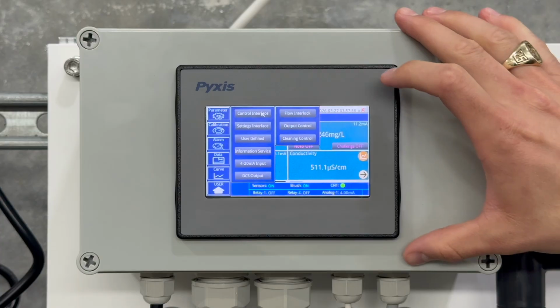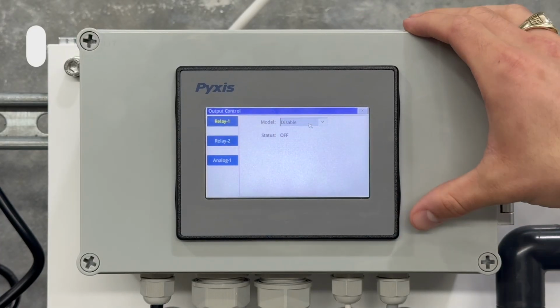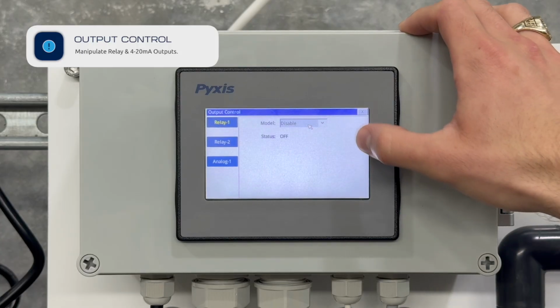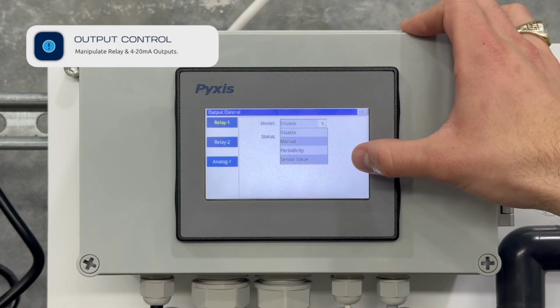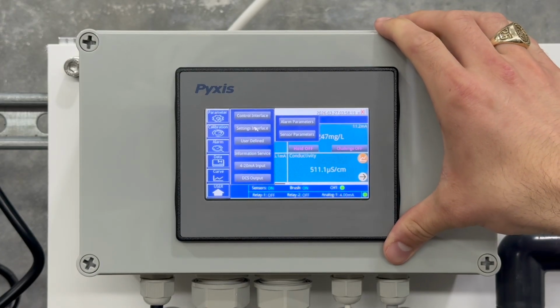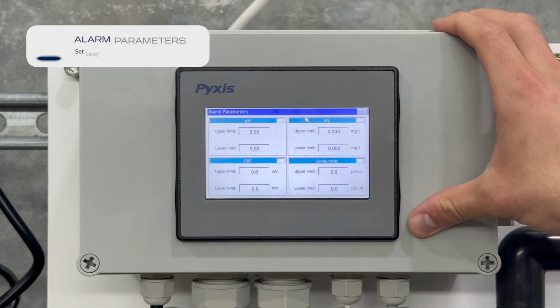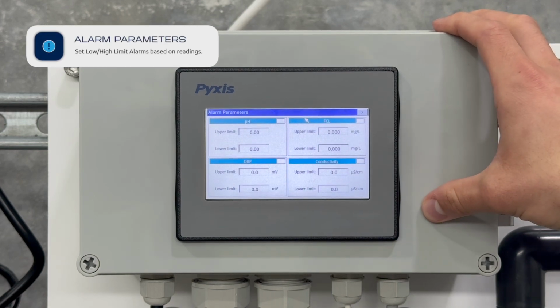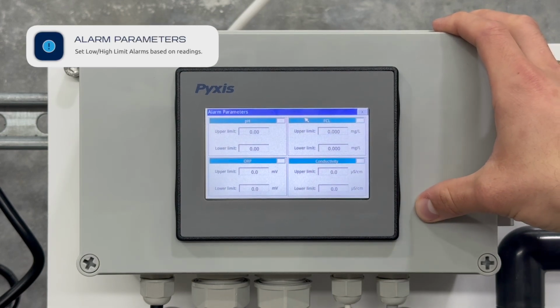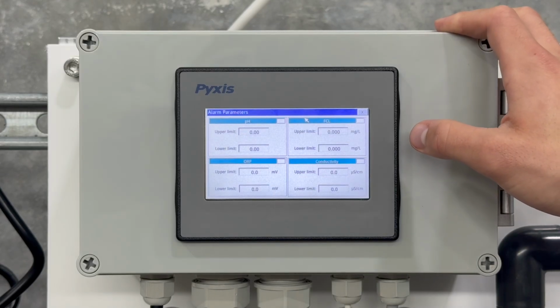Underneath flow interlock is your output control. This is where you can adjust your relay 1 and 2, turn them on and off, change what settings it is dependent on. Underneath control interface, you'll find your settings interface that will allow you to adjust your alarm parameters. Here you can type in your upper and lower limits for each measurement, and it will send the alarm if it goes out of range.